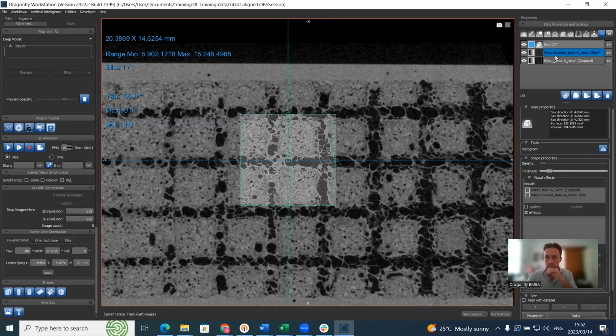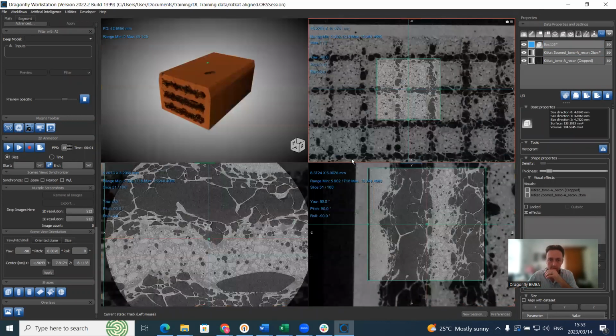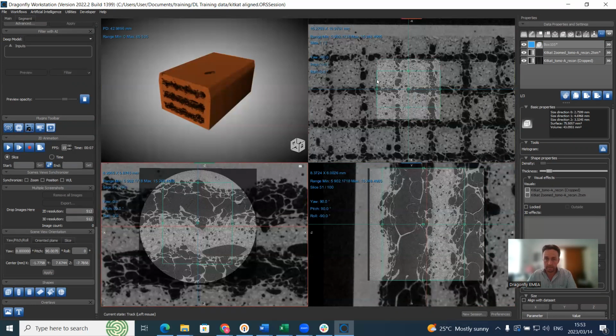So we're going to use the box from the zoom scan. First of all, we're going to crop a little bit here because we don't want the 0 pixels part of the training. We just want to limit it to the actual data, not pixels outside of the data, and we don't want edge pixels on the other axis either. So in this axis, we can just crop it a little bit. And we see that this is now all within the correct zoomed scan.